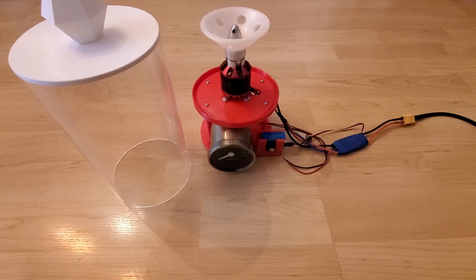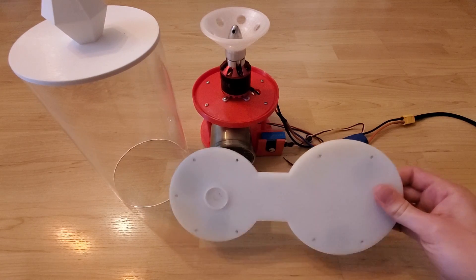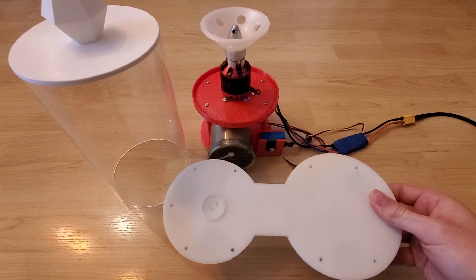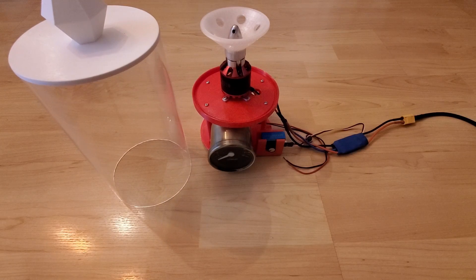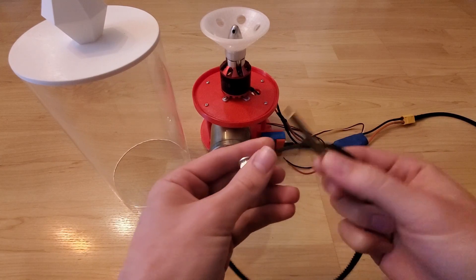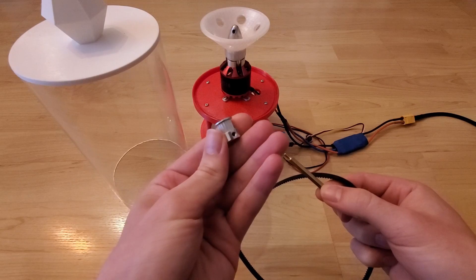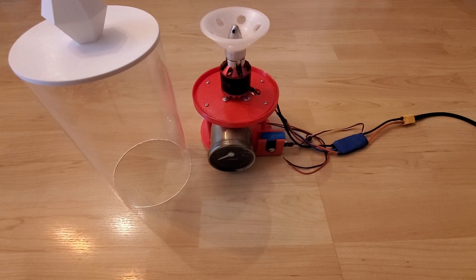So first off as you can see it's much smaller. We compare the footprint of the previous one, it's about half the size roughly, and also it no longer needs a lot of extra parts, for example these standoffs, pulley gear and the pulley itself. It's all eliminated.